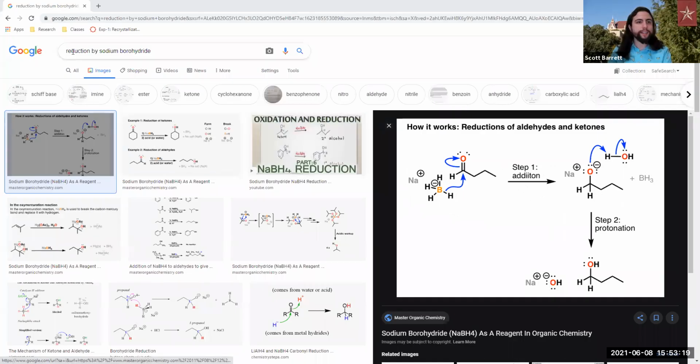Those are stronger and have more resonating effects, such as the hydroxyl group performing a keto-enol transformation that you may know of from organic as well. So that tautomerization will actually enable it to be reduced by sodium borohydride. A lot of these things in organic too will be more in-depth understandings and mechanisms that you may be learning in class additionally.